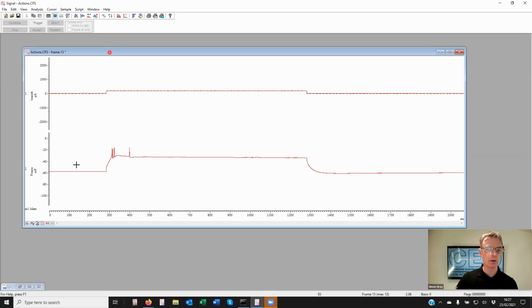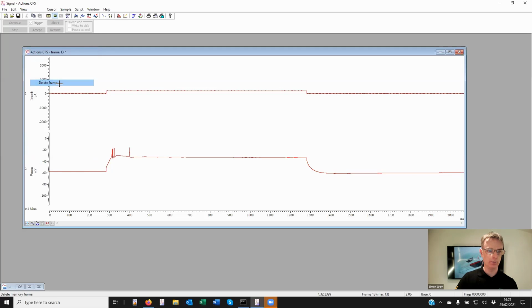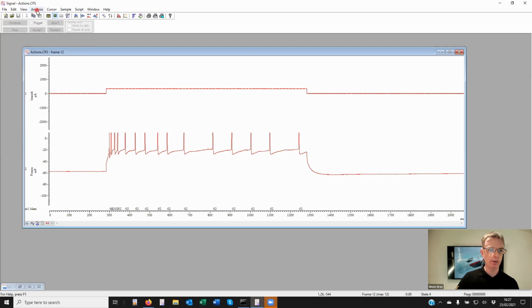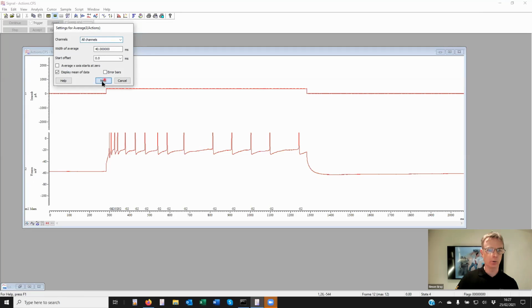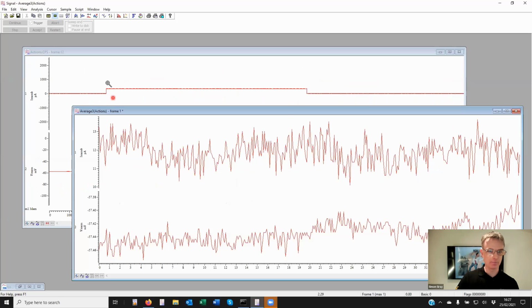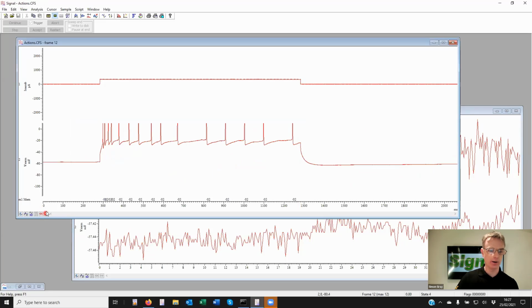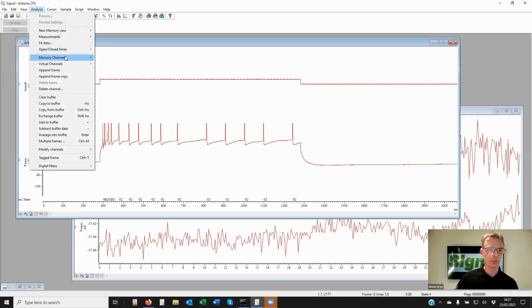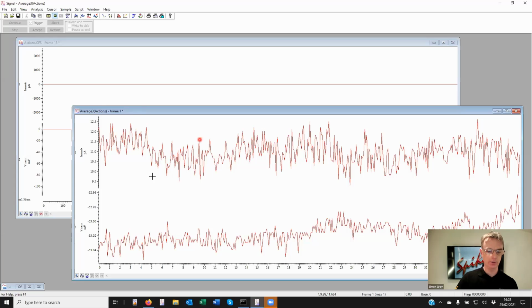There are more convenient ways to do this, though. I'll just undo that in a moment. I can build up an average using memory views. Let me do a quick average in here. I wanted to put that on the end of the file. Again, I could do a frame analysis, end frame. I can go into this file, this view.